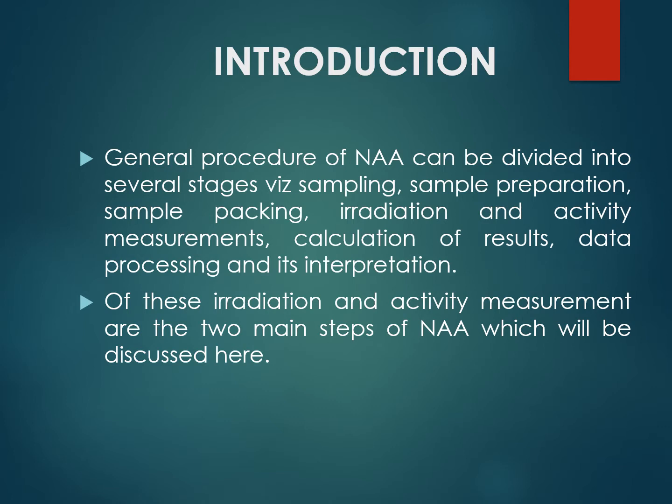Then that aliquot is packed by using different packing techniques, and this process is known as the sample packing technique.